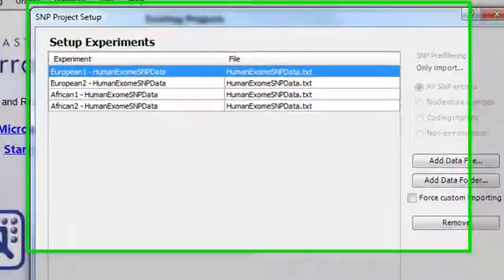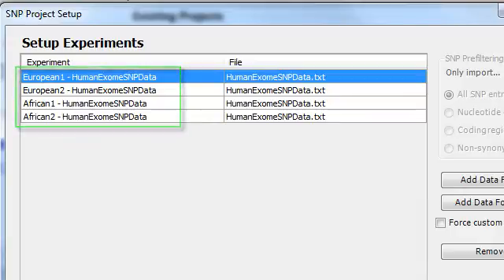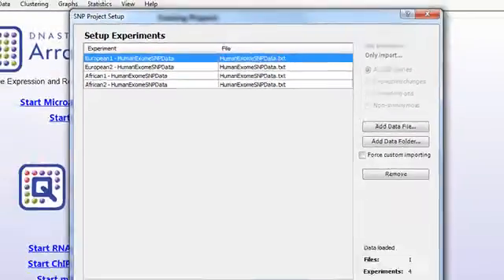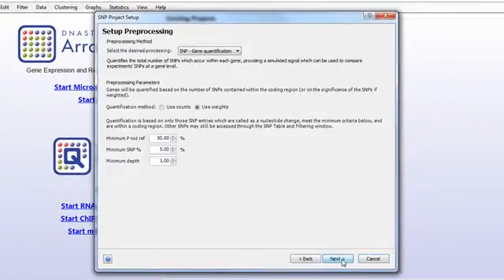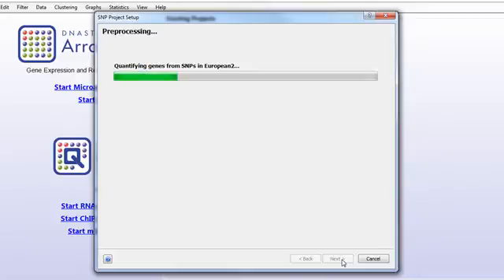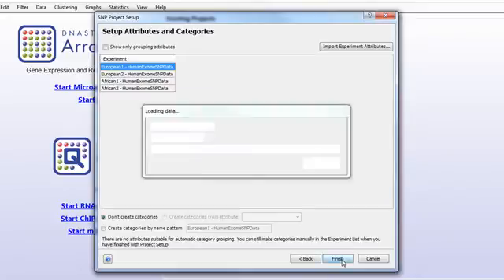Here you can see that each of my four exomes has been imported and labeled with the same names that I used in SeekMan Engine, so all I need to do is click Next to finish the import.